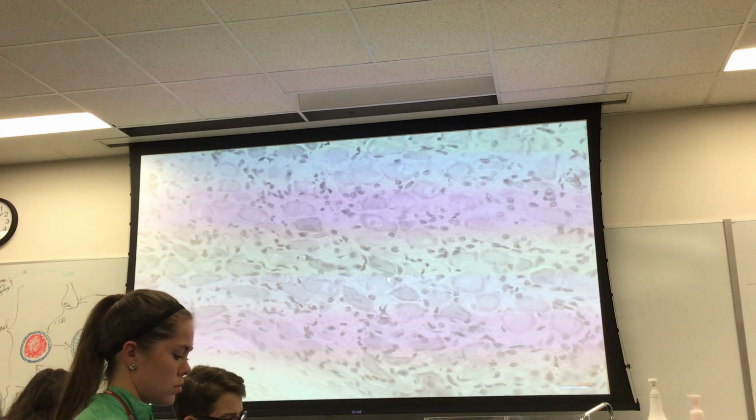But my question to you, and maybe I'll drop the mag for your benefit, is this a sympathetic ganglion or a parasympathetic ganglion? What do you think? I'm going to go with sympathetic. Why? Because parasympathetic has to be in the wall of an organ.